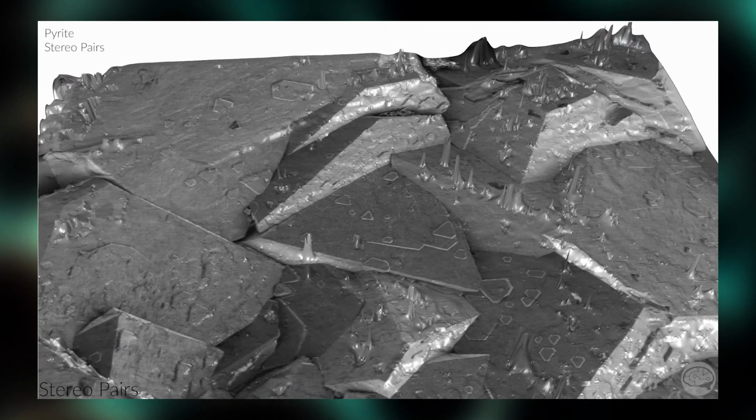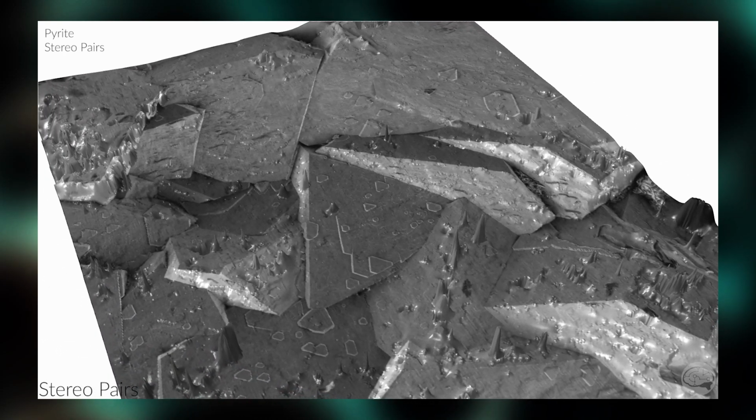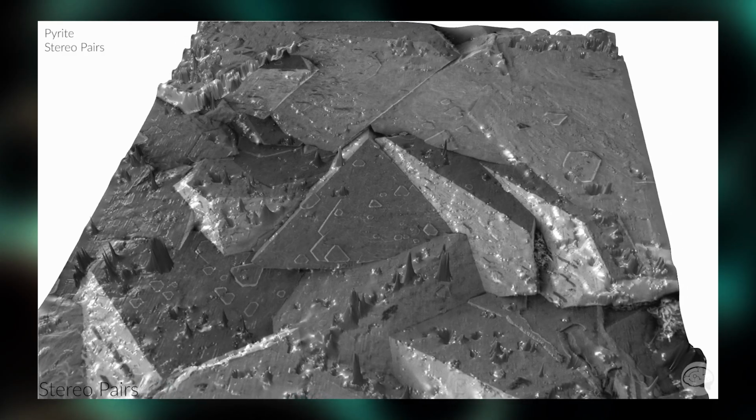So what is good and bad about stereo pairs reconstructions? Pros: the Z measurements are going to be very accurate because the angles between the 2 or 3 images are known. The software will do a bunch of fancy trigonometry to make the 3D surface. It doesn't require any calibration of the instrument, it's just going to work. The other main bonus to this method is that it can handle high aspect ratio samples very well. So if you have a steep 90-degree drop-off on your sample, this method should be able to understand the surface and reconstruct it with no problems. And as I mentioned earlier, it's fairly easy to perform since all you need is an SEM stage that tilts, which about everybody here has.